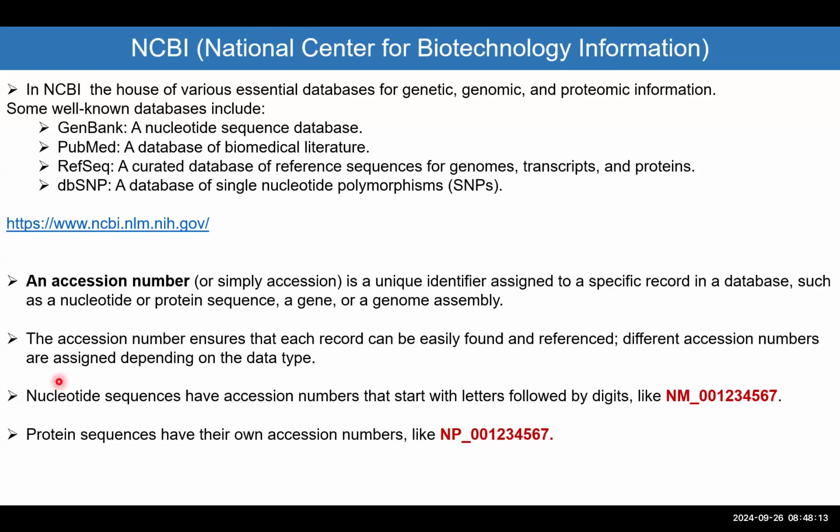And that's what it says here. Now, one thing you have to keep in mind and understand directly from the name itself: if you see accession numbers such as NM and then these numbers, this directly tells you that this is the messenger RNA, M standing for messenger RNA.